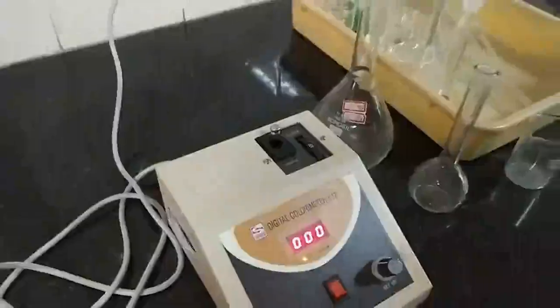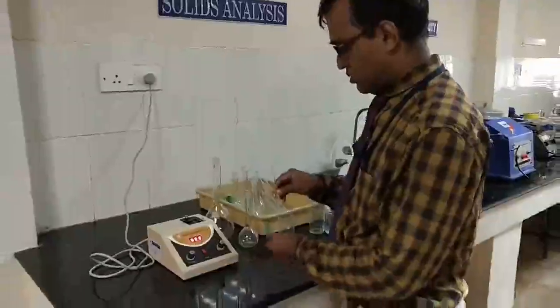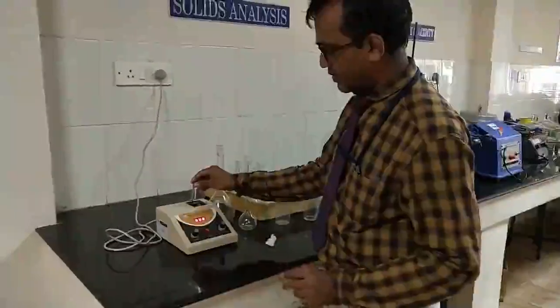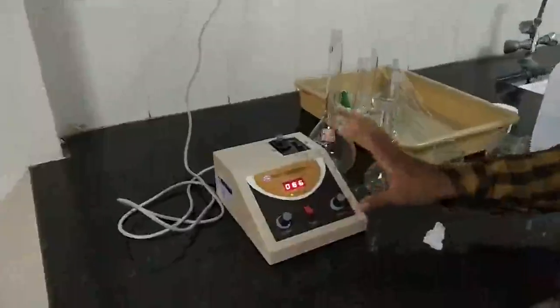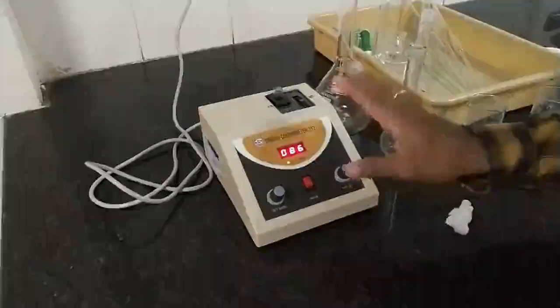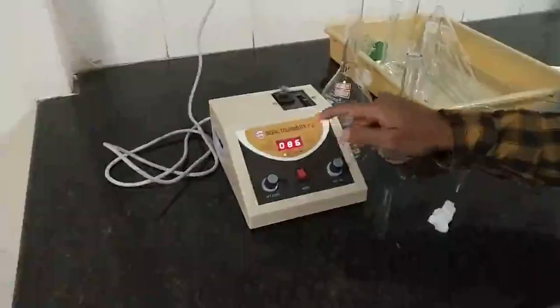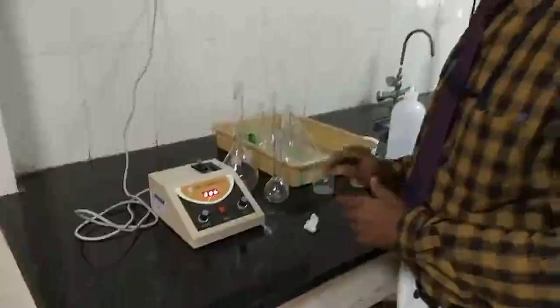This is the wavelength you have to use for the copper sulfate solutions. Then you keep the sample in the sample holder, and this digital colorimeter directly gives the values of the percentage of transmission. You have to note down these values for the different concentrations of sample.